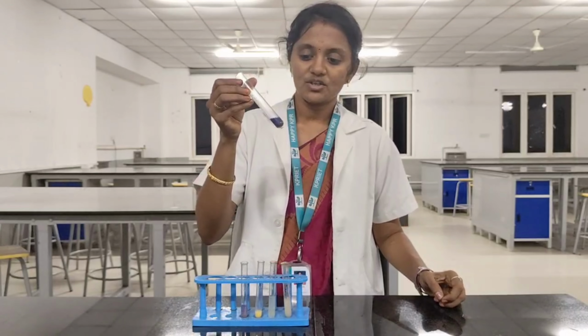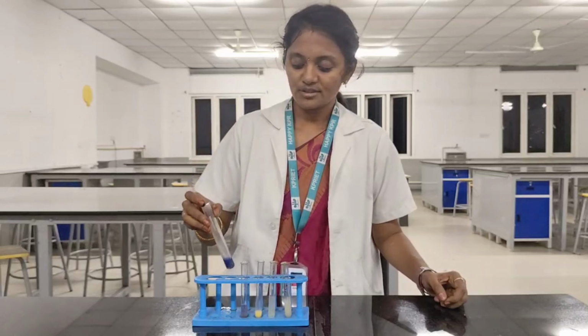And about the confirmatory test, the Biuret test, we can see the violet color formation when we added Biuret reagent, and this confirms the presence of peptide bonds in the protein sample. And finally, about the Ninhydrin test, when we added Ninhydrin reagent to the protein sample, we can see the formation of purple color. This denotes the presence of free amino acids in the protein sample.